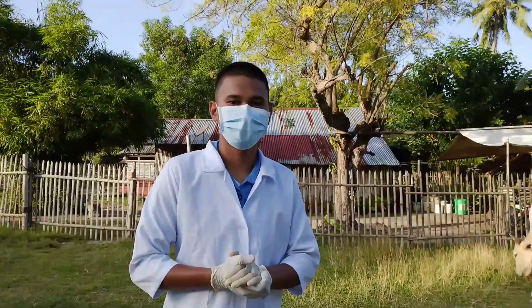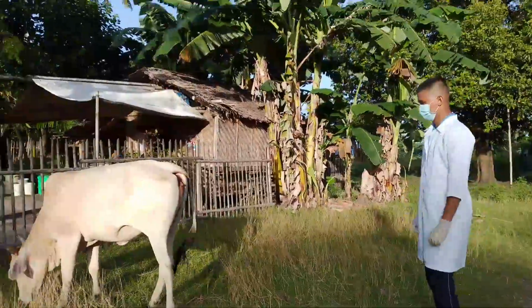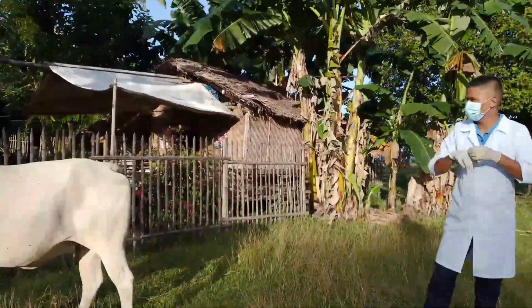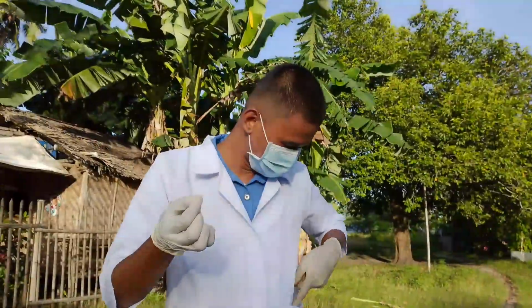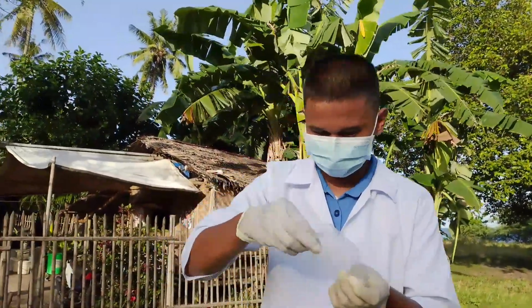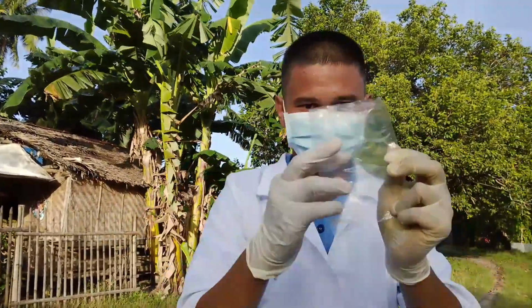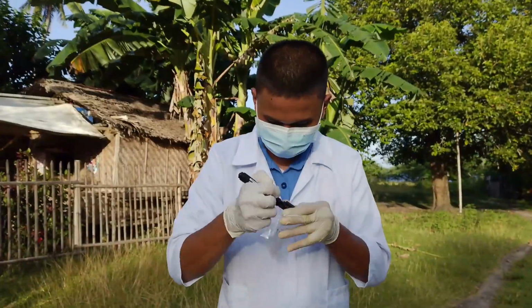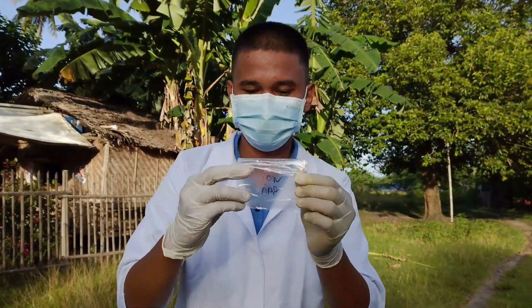Now I will proceed to the fourth animal, which is the cow. I have here the cow's hair, so I will put this into the plastic and start collecting it.